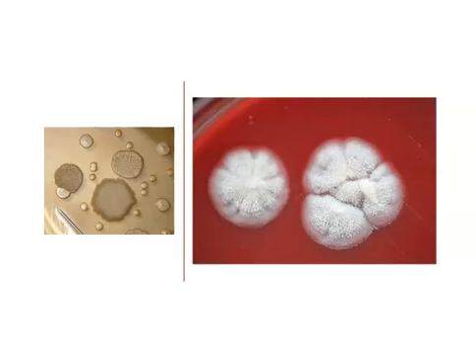We're not going to spend a lot of time in this course practicing colony morphology. I just want you to be aware of what it is and how it's done and the way we interpret it, especially the idea that if we see 3 or 4 distinct kinds of colonies on a plate, we never make the claim that that means there are 3 or 4 organisms on that plate.